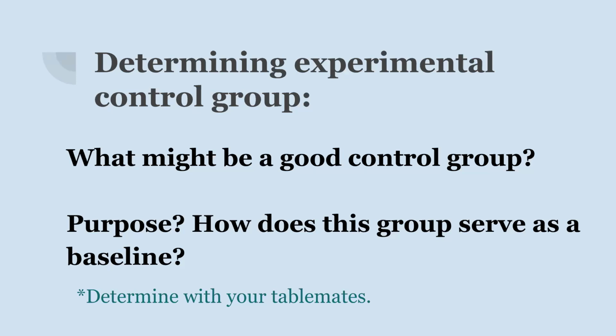So for this one, the positive control would serve as a good control group, right? Because we're heterozygous for that banding. So we're getting that per3/4 band and that per3/5 band. And that serves as a good basis of comparison when we're looking at someone who is homozygous for per3/4 or per3/5, or heterozygous for both genes at 250 and 300 base pairs. Because we can see those bandings apparent in that heterozygous individual. So that would kind of help. And again, that'll answer that second question.